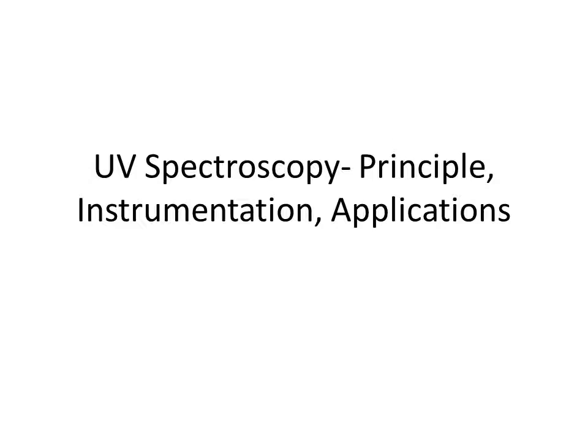Okay, next topic of Unit 551 Analytical Instruments, Unit 1. The topic is UV Spectroscopy. Here we are going to discuss the principle of the instrument, what instrumentation system is going to be used, and what the applications are.